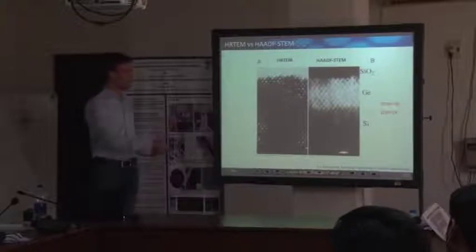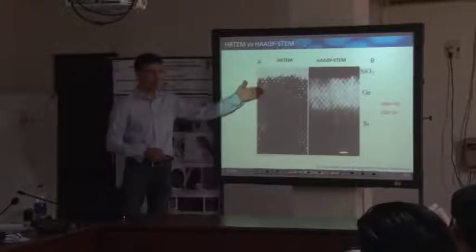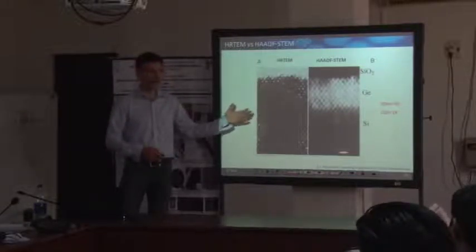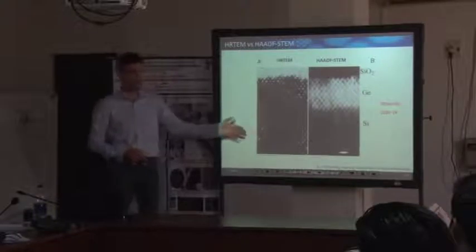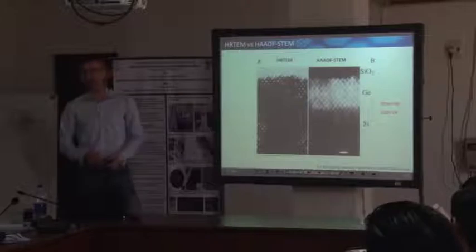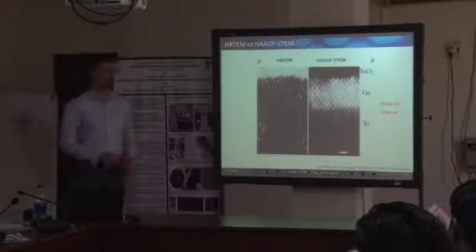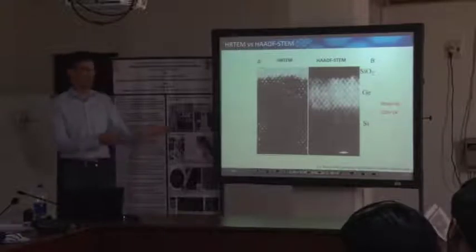So you might run into trouble not seeing a lot in conventional TEM imaging. This is an epitaxial film, so there is hardly any diffraction contrast, as the orientation is almost the same. You clearly see such chemical differences in the STEM image using high angle annular dark field. This is convincing, isn't it?